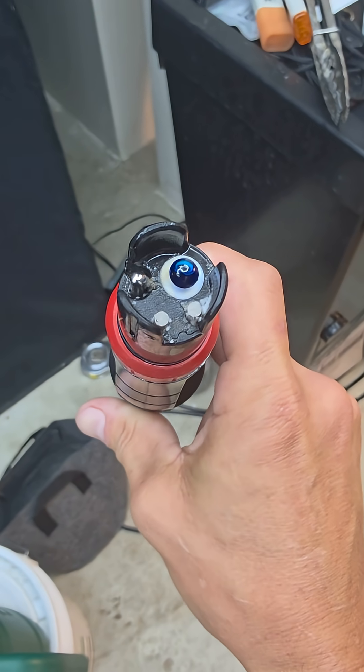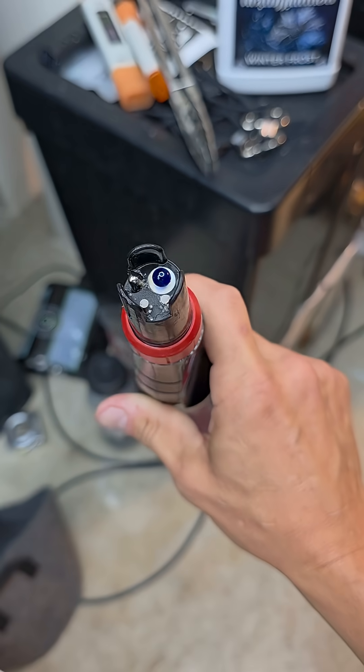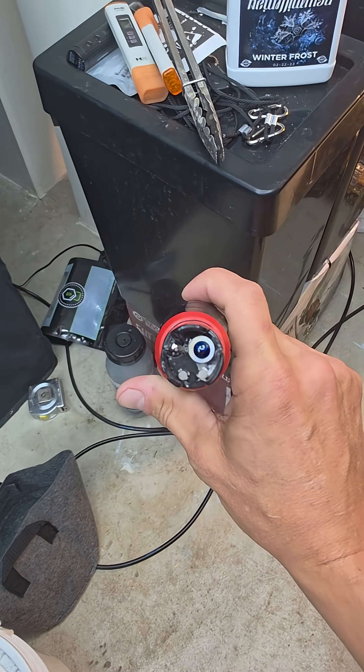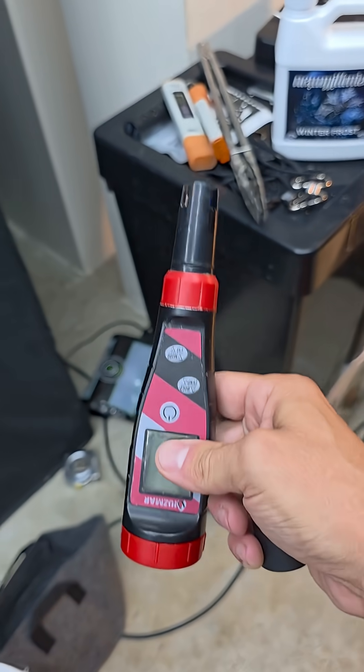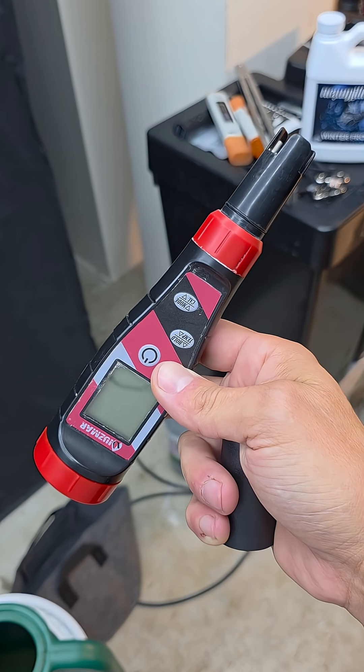It doesn't matter so much if this piece stays wet or dry. They say dry it off — I usually just give it a few shakes and then put it back in the cap. So far, since I've done that, I've had it this whole entire grow — it's been four months. I haven't had to calibrate it. It's still working great.